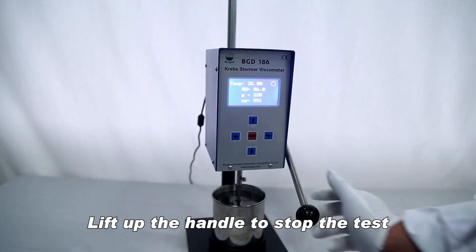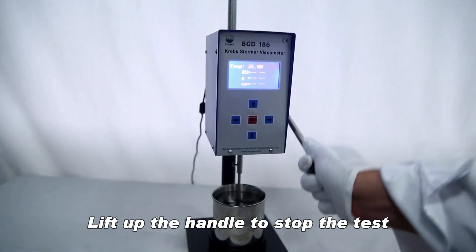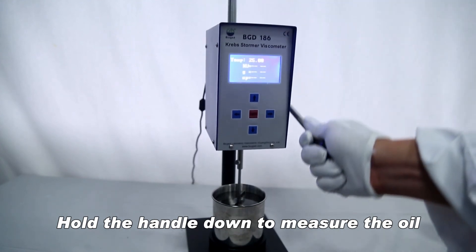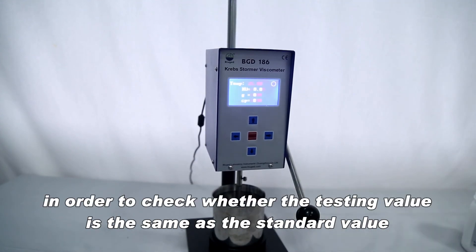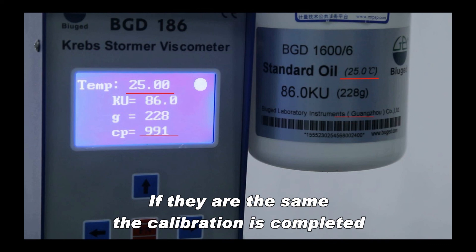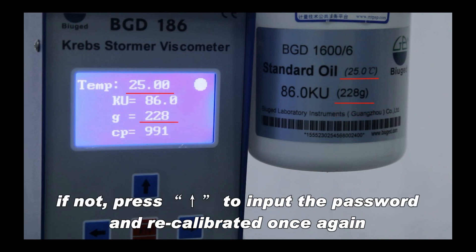When successfully saved, the whole screen will show that the save was successful and return to the main interface. Lift up the handle to stop the test, then hold the handle down to measure the oil and check whether the testing value matches the standard value. If they are the same, calibration is completed. If not, press to input the password and recalibrate once again.